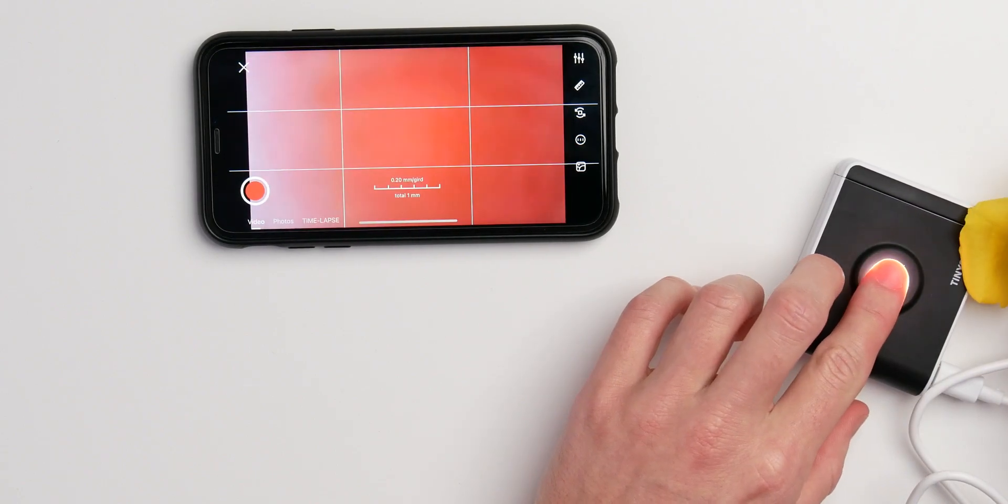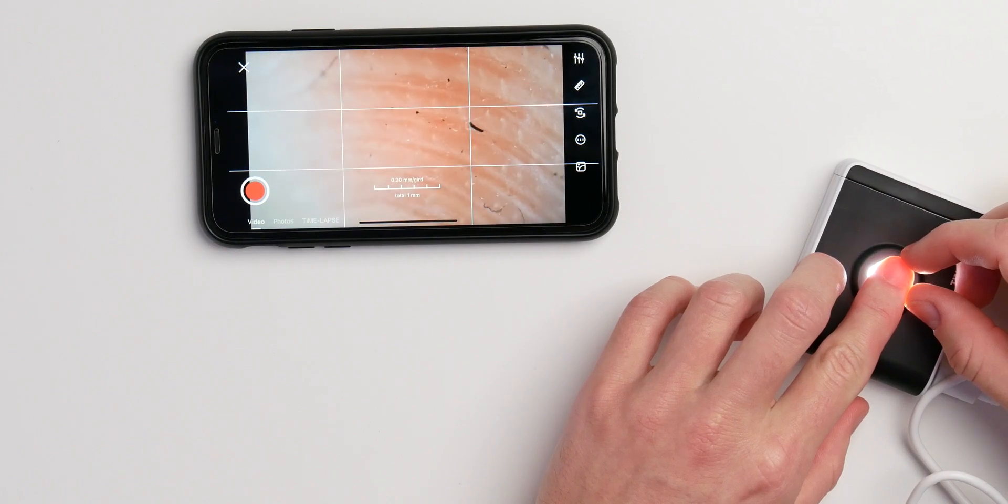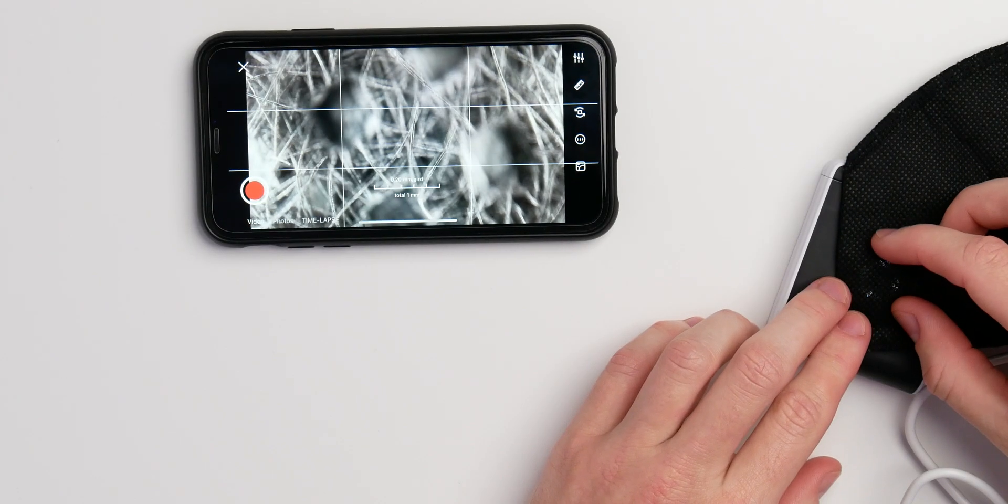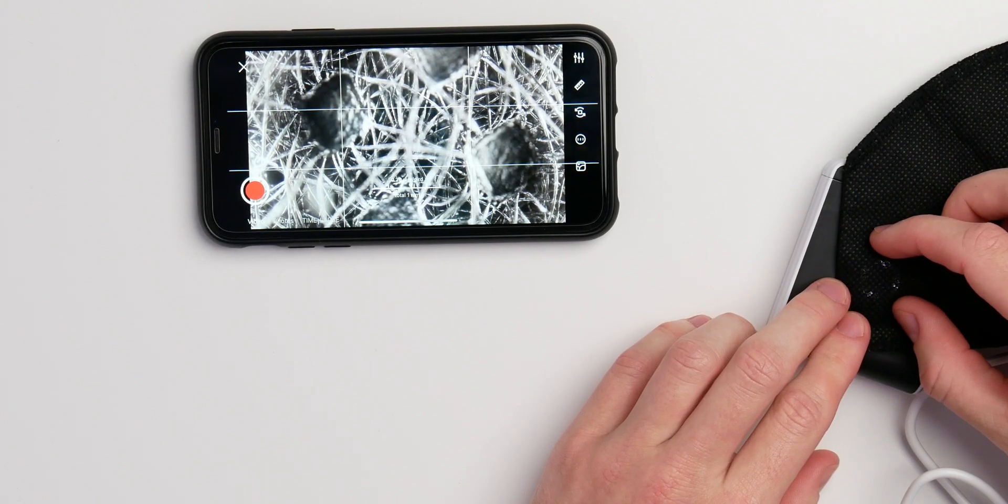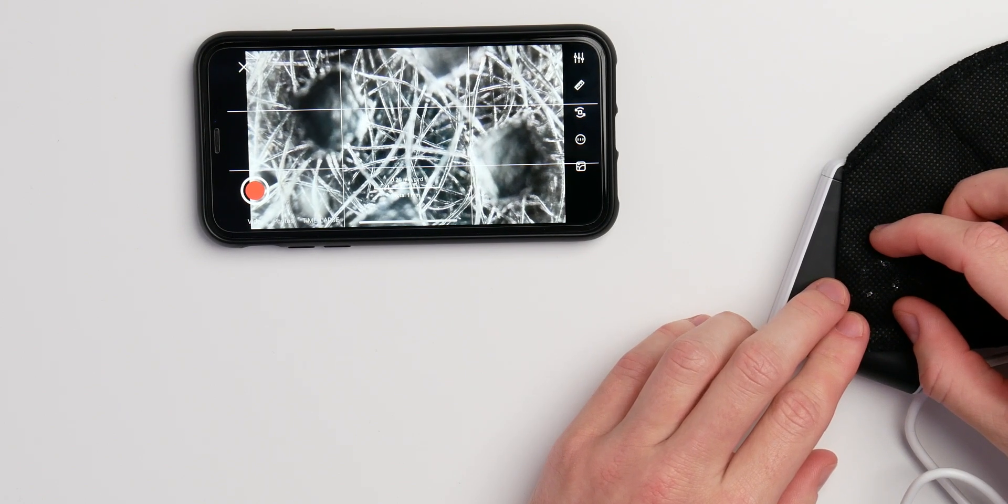I can probably also put my finger on it and you will see it's somehow dirty. And because it's just Corona, I have one of my favorite masks. Pretty simple, pretty basic. And we can also take a look at it. And wow, it looks just really interesting to me, at least.